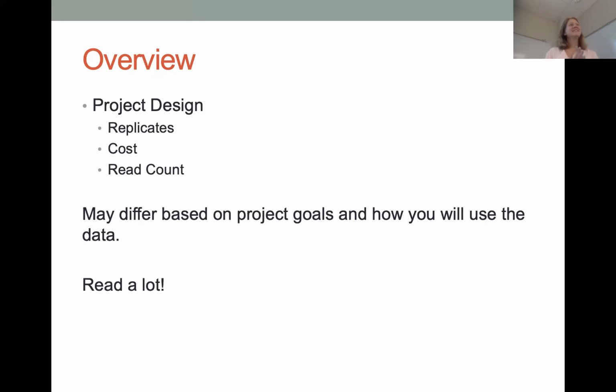No? A lot of projects I see are using MiSeq. People use MiSeq. Yeah, we're ordering everything right now from HiSeq or NovaSeq, just because we can do 20 to 30 libraries at a time on a lane, which is really nice. On the MiSeq, you're looking at doing just a handful. So it scales. Because we're usually looking at ordering, like for Gilly's project, how many samples did you have? 90 something?